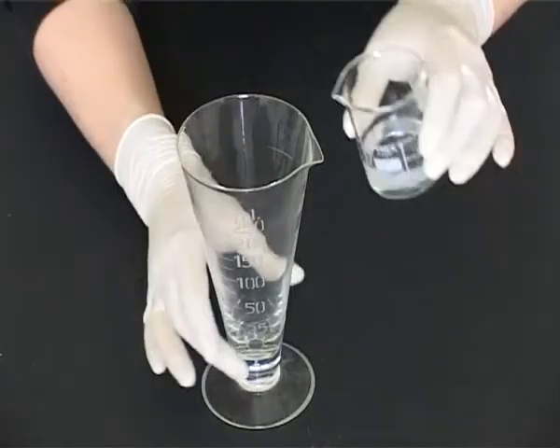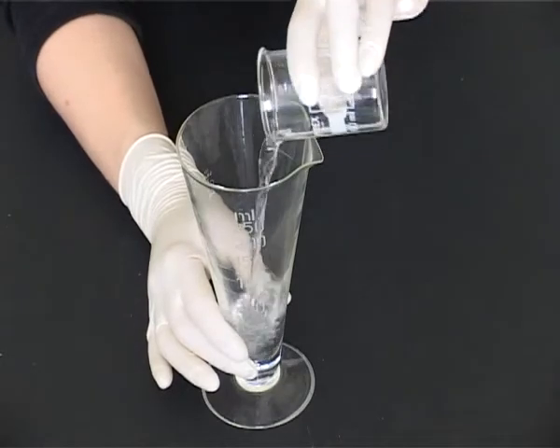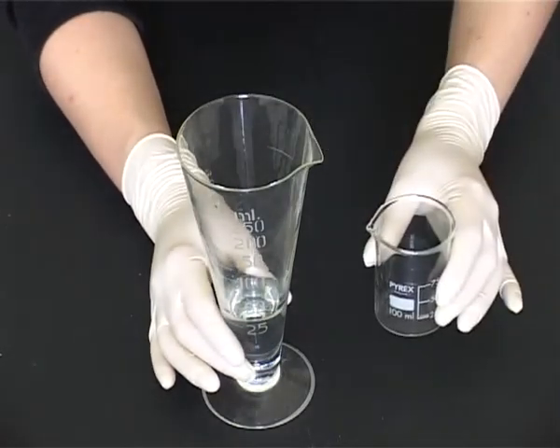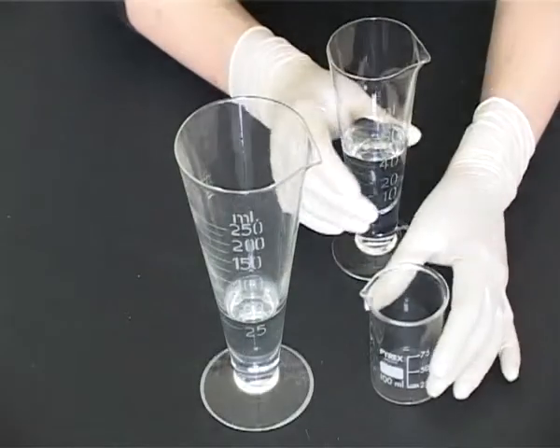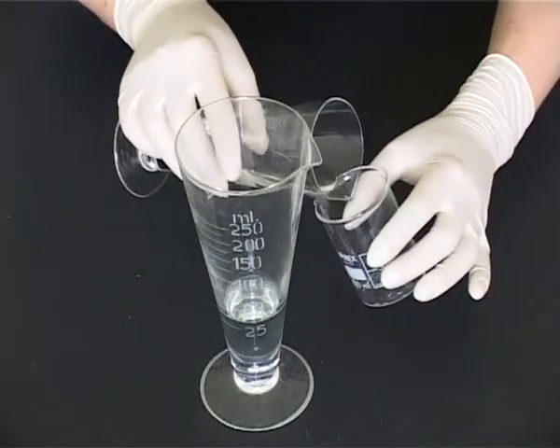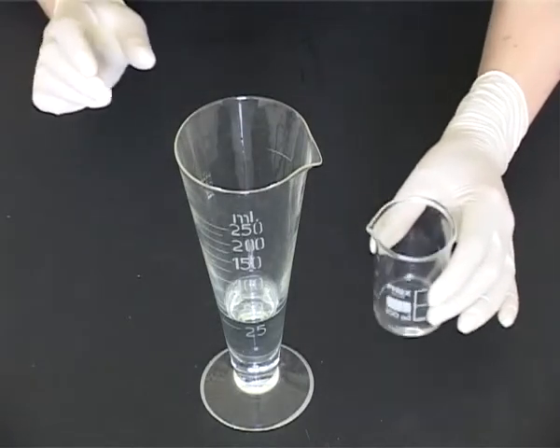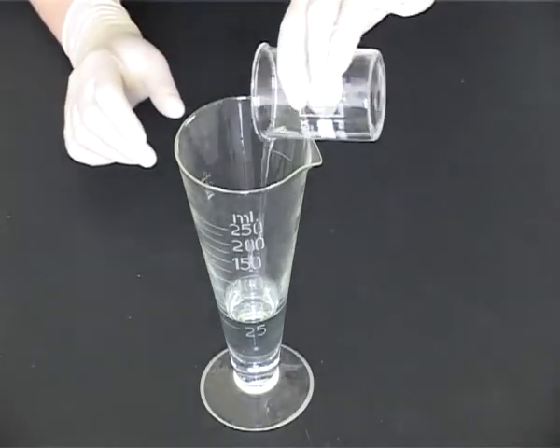Transfer the solution to a suitable conical measure. For example, if preparing 50ml of a solution, transfer to a 50ml conical measure; if preparing 150ml, a 250ml conical measure would be most suitable. Rinse out the beaker with more vehicle and add the rinsings to the solution in the measure.